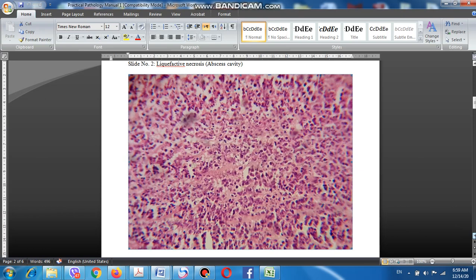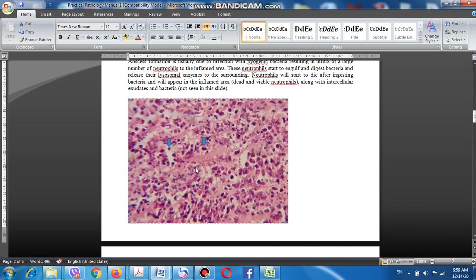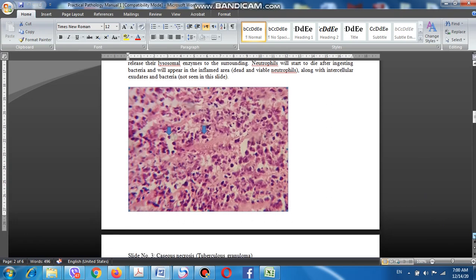This is a high power view of the same microscopical section of the abscess cavity. As you can see, there are a very large number of neutrophils — we know they are neutrophils because they have multi-lobed nuclei. In between, you can see the exudate. If we use a special stain designed to detect bacteria, such as Gram's stain, we can find bacteria — these small dark dots are possibly bacteria.